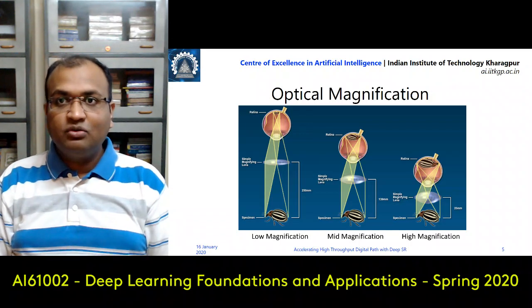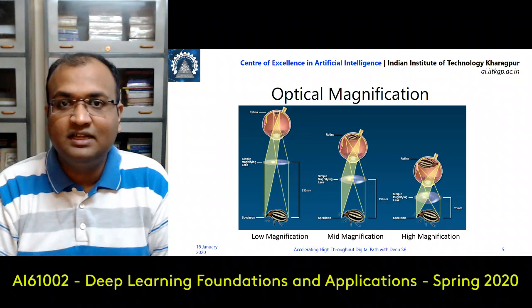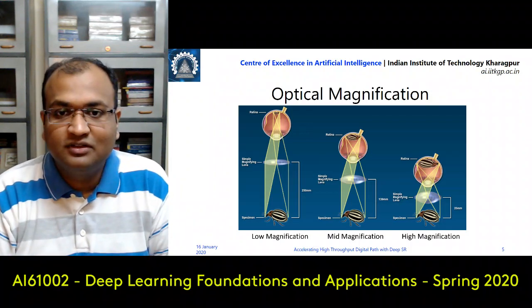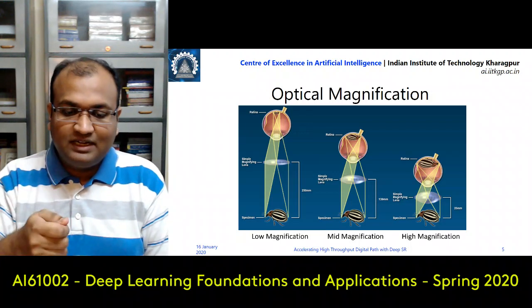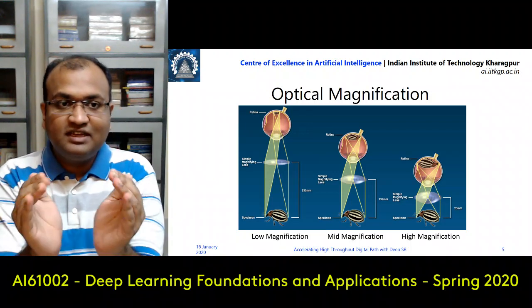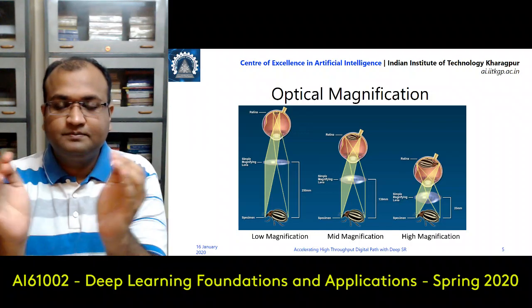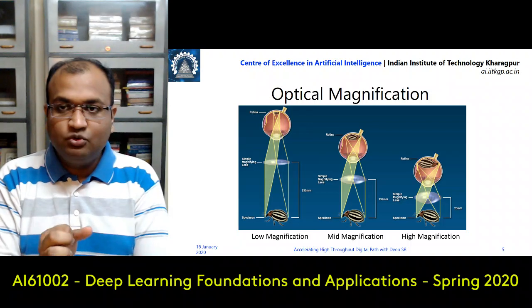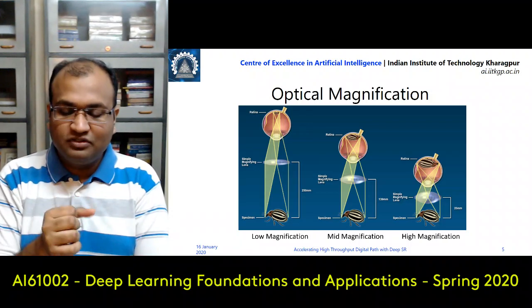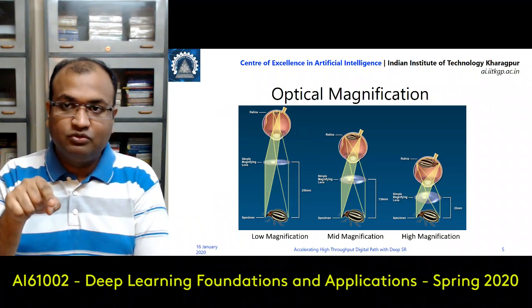And if you remember very carefully, or if you tried this as a kid, or if you haven't, you can try it out yourself these days as well: if you try to focus white light coming from very far off on a lens, you would see at the periphery of the focus a bit of a bulging nature. So it will not be a point light. You know that if you have a parallel source coming down to your point of focus with a magnifying glass, you should get a point source, but it's never a point source.